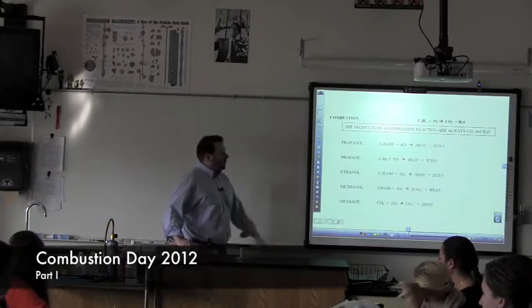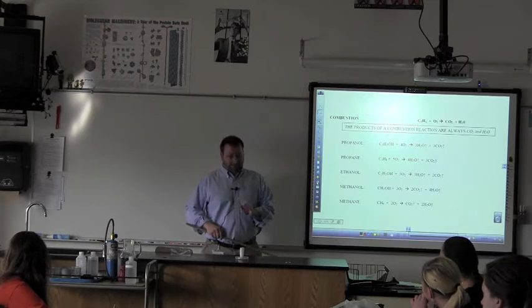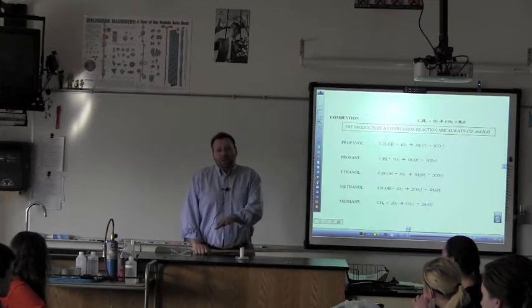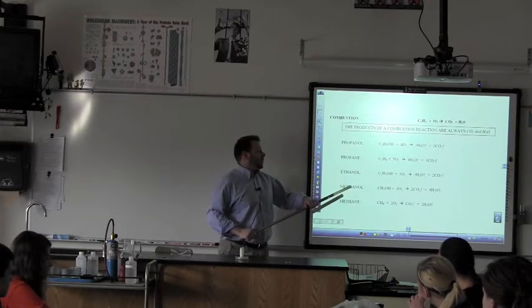Combustion day is a special day. We get to burn a lot of stuff. But I like to think of it as burning for learning. There's a reason we do combustion day, and it's so that you know how to verify a combustion reaction and how a combustion reaction works.